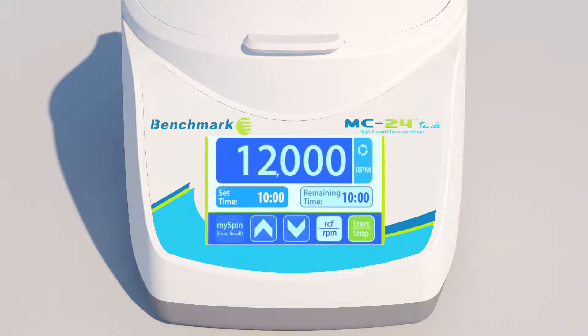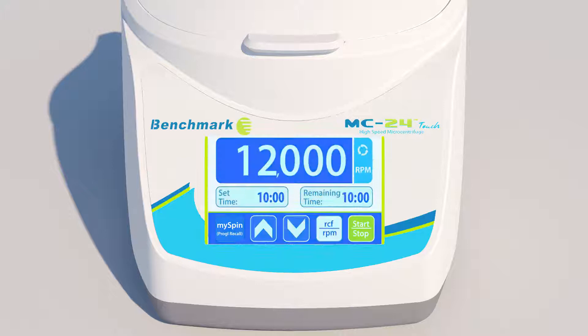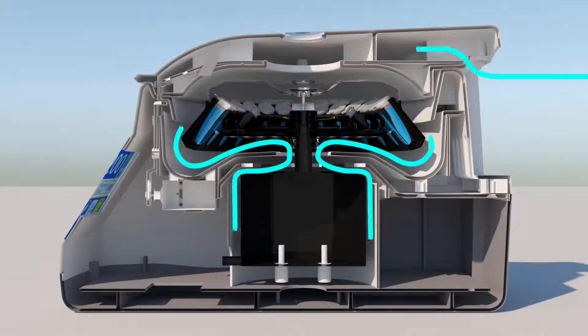Now, at any time — even after the machine has been powered off — you can recall your favorite program with one touch of the MySpin button.